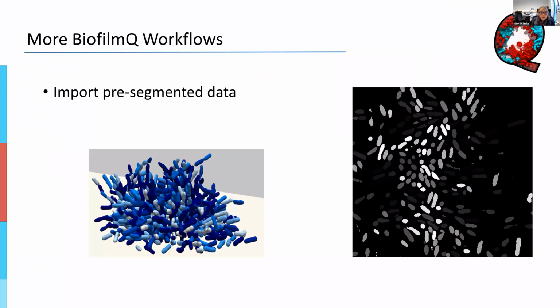This next slide is something that, for those of you who were not away in the last break, we already had touched on very quickly. So here, the idea is, what happens if you want to use single cell segmentation? And this might be the case for some people. We know that a lot of people like to use single cell segmentation, especially when working with biofilms and confocal images, because they have single cell resolution and they want to make use of it.